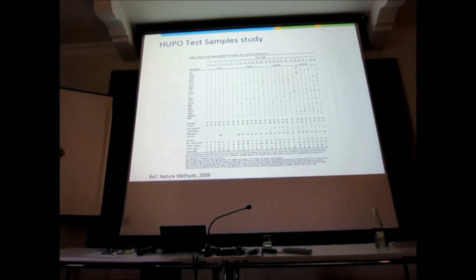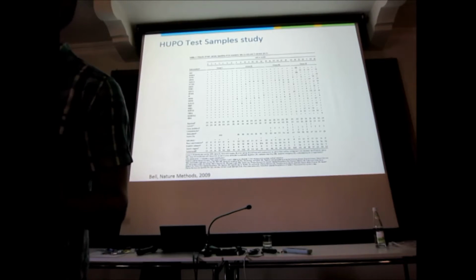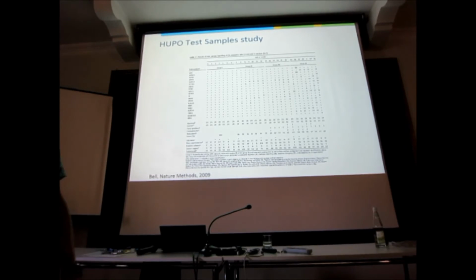And now you see that a lot of these proteins are wrong. Look at these guys, you know. Screw-ups. Huh? These guys too, screw-ups. Now this is not helping. Now you look at this and you think, oh, everybody does it wrong. But you know what the problem is here? Protein inference. John told you about protein inference, right? If you look at the peptides that people matched, every group matched peptides from all the proteins. So they got the peptides right. What they got wrong is the assignment of the peptide to the exact right accession number.